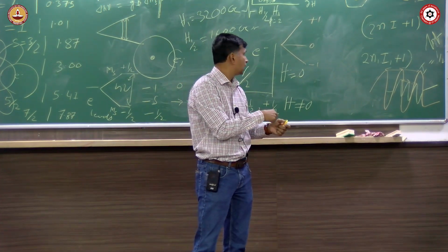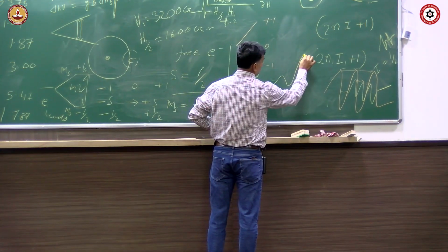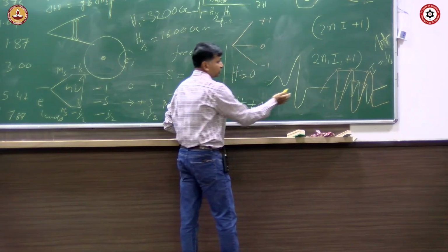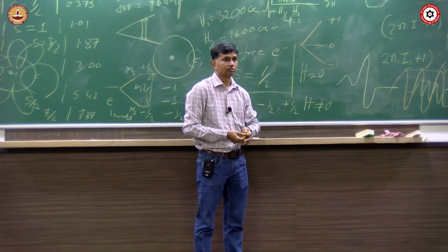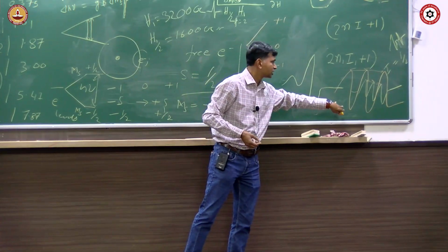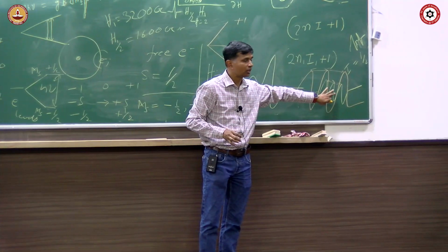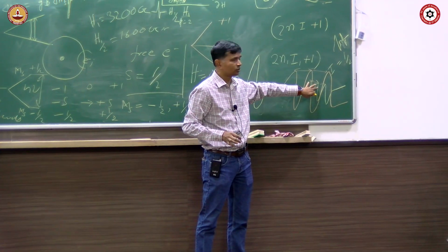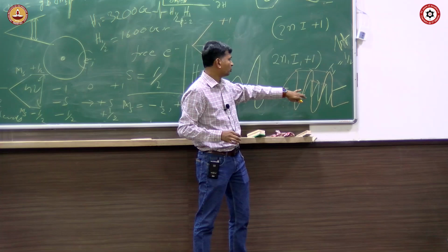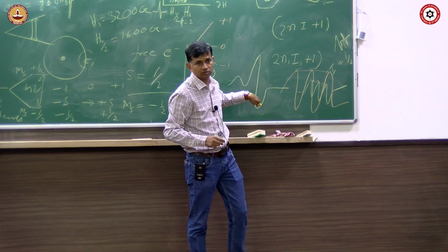And if I get the same spectra, not like this, but the spectra becomes like this, what does it mean? They will speak about the distribution of the spin density. Here they are similar in shape, and you cannot say much about the distribution. The moment this shape changes to something like this, you have a different thing to say.